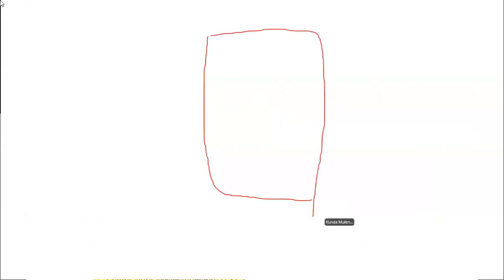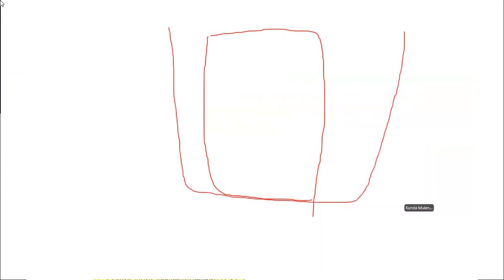say for instance, this paper which we call the chromatogram. And then we want to put this in the beaker. You know that most of the solvents that are used are volatile, so it's important that on top you close it. Okay, maybe this thing is not nicely drawn. Just allow me to have it drawn in the best way. Let me just draw it here.